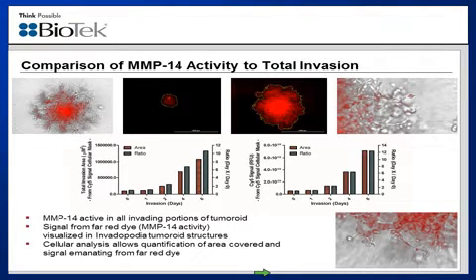We can also perform cellular analysis using the Cy5 signal from the dye, and as you can see here with both the images and the graphs that I'm showing on this slide, the object masks are drawn in a manner similar to what I explained previously. So again, you're not using GFP or Brightfield signal, but actually using specifically the Cy5 signal to have Gen5 draw the object masks around the parts of the tumoroid structure meeting the analysis criteria.